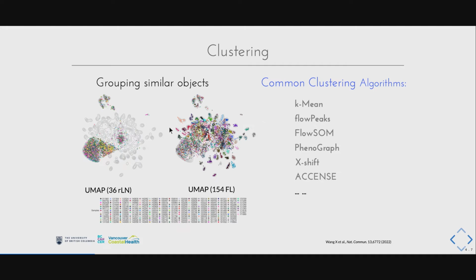Let's look at this dimension reduction plot for CyTOF data, which includes 190 samples and measures 38 parameters or markers on each single cell. Here we include 36 normal lymph node samples and 154 follicular lymphoma samples. If you do a mental clustering in 38-dimensional space, it's just impossible.